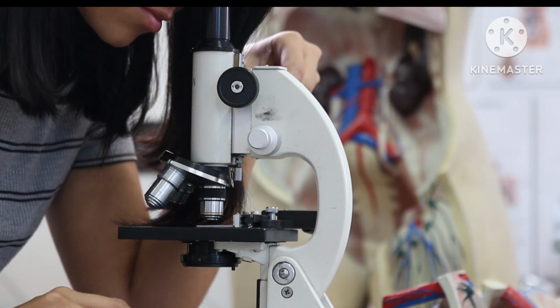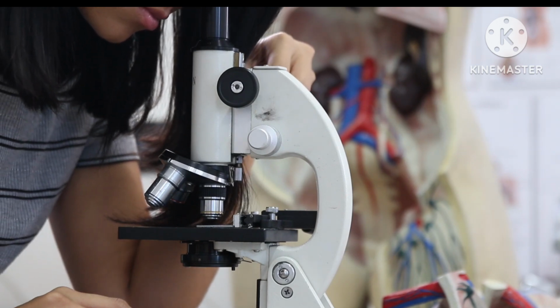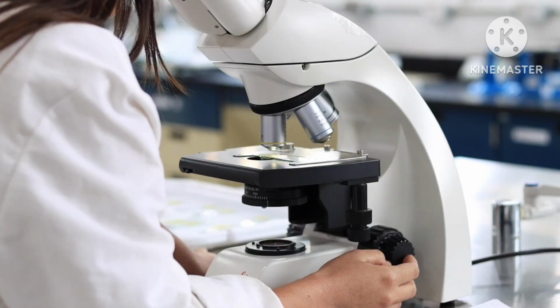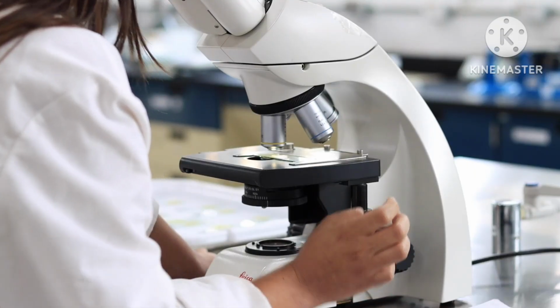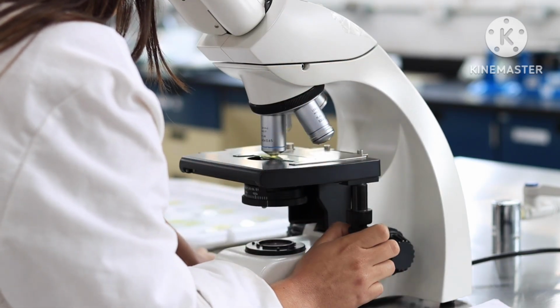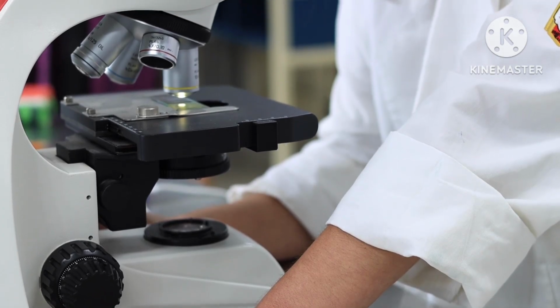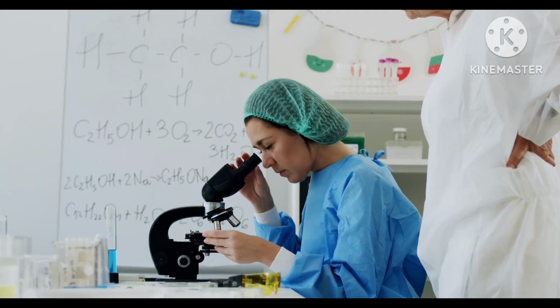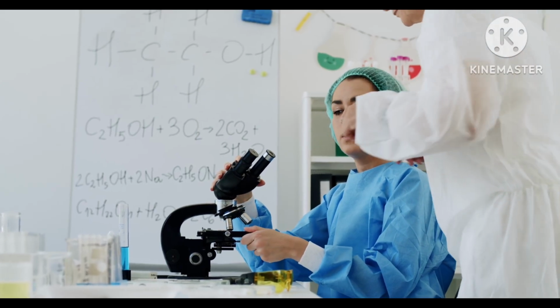Now, here is the most important point for you as a student. The microscope is not just one chapter in your syllabus. It is a foundation instrument in MLT. If your microscope basics are strong, many other subjects become easier. So, before learning advanced laboratory tests, you must first be comfortable with the microscope.